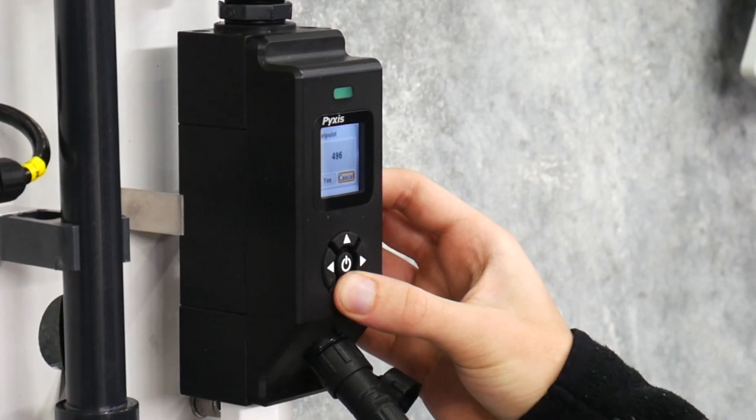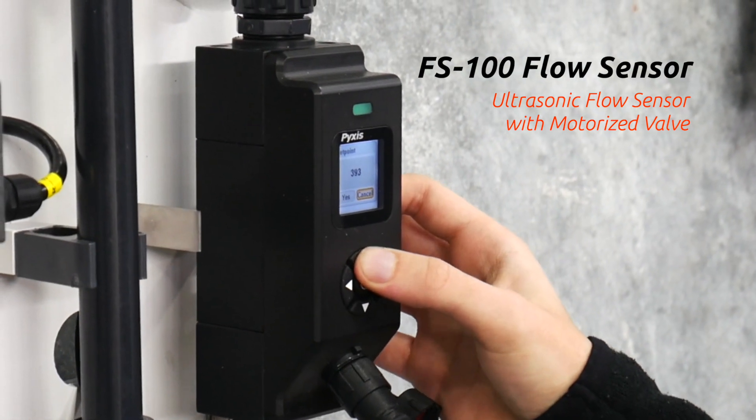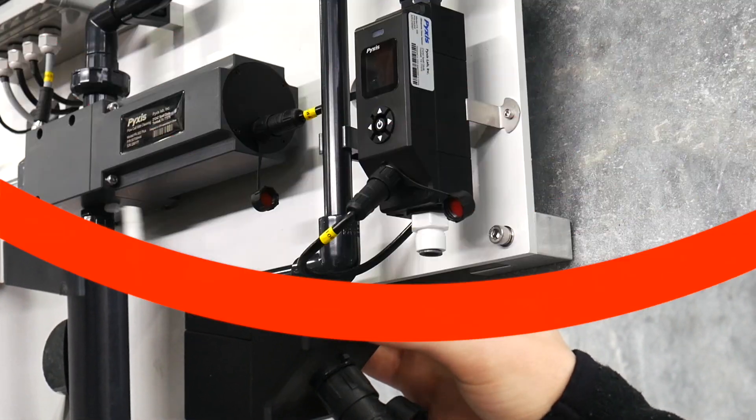The next addition is our FS100 ultrasonic flow sensor with a motorized valve for user setpoint sample flow measurement, regulation, and interlock.